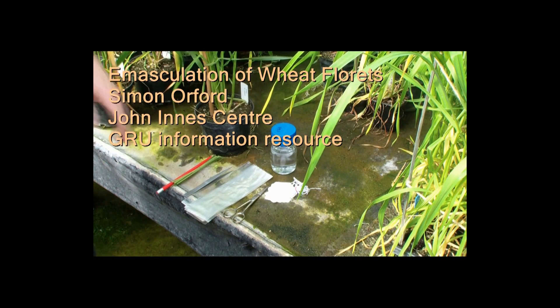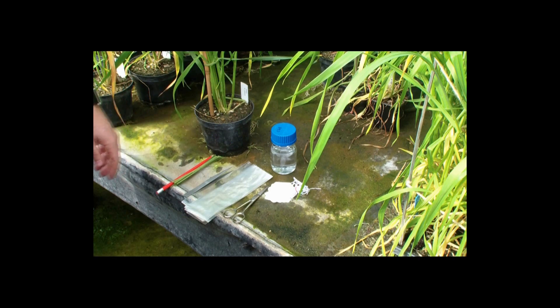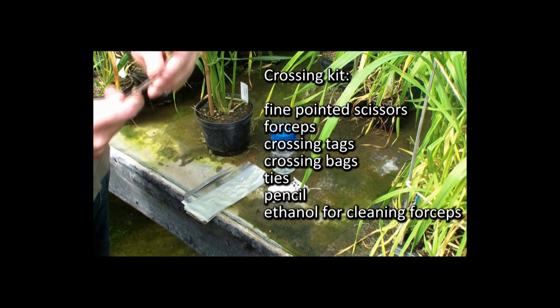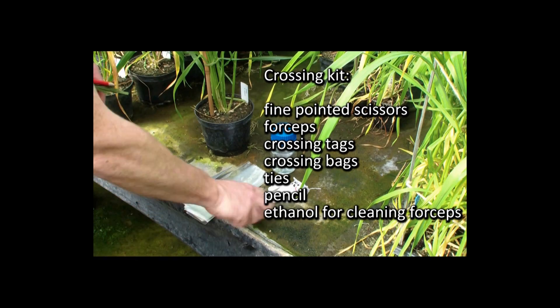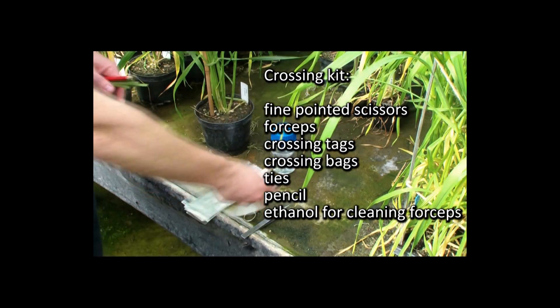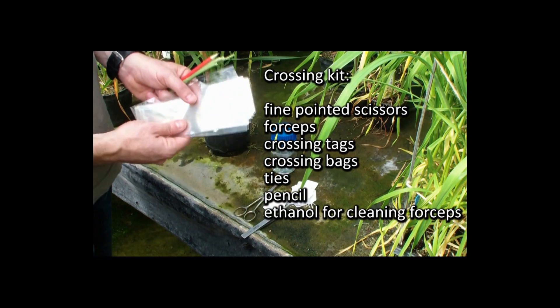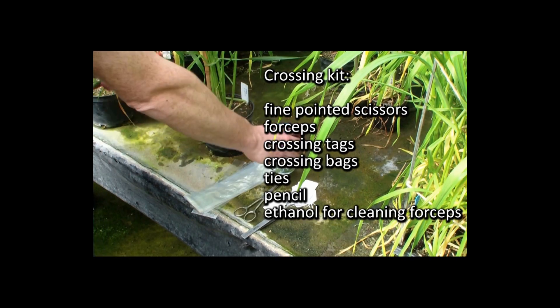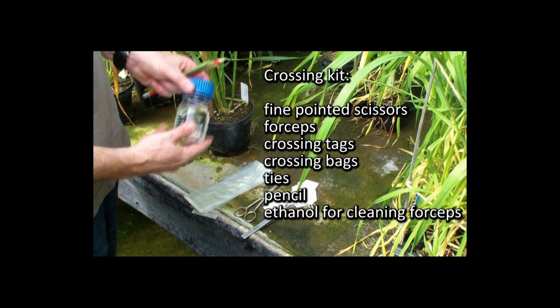Let's begin the process of plant breeding. We get together our crossing kit which involves some fine pointed scissors, forceps, crossing tags, crossing bags, ties, pencil, and ethanol for cleaning forceps.